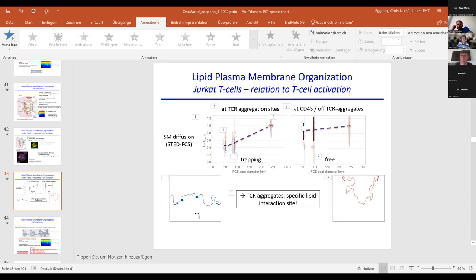You need as many molecules as possible, and you need them very close to each other. That's why, of course, FCS, by averaging over a lot of single molecule events, you can get out of the noise. And that's why you can also look at the microsecond timescale. Exactly. With tracking, the problem is that you have to bundle. It's the famous law, the square root of the number of photons you get, and it scales with that. The higher the photon number, the higher the localization precision, the more precisely you localize the molecule. That's why you are limited. You have to gather a certain number of photons to get that, and with fluorescence, you have to wait a while. Then, of course, you also have to read out the camera and so on, and that reduces your time resolution.